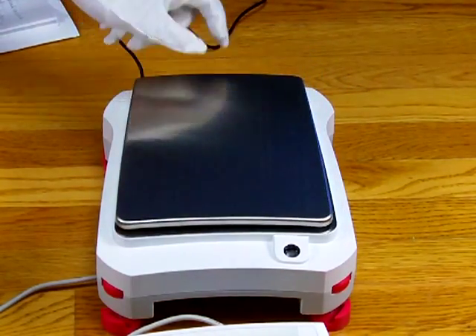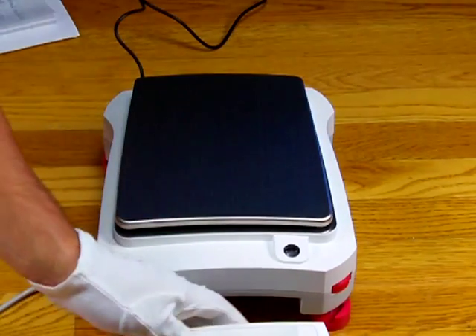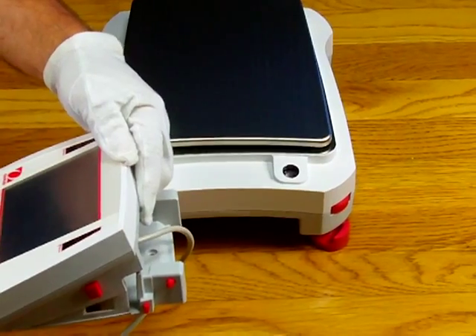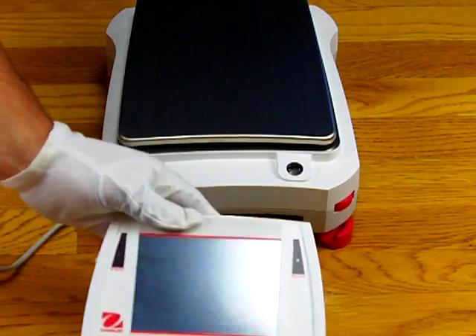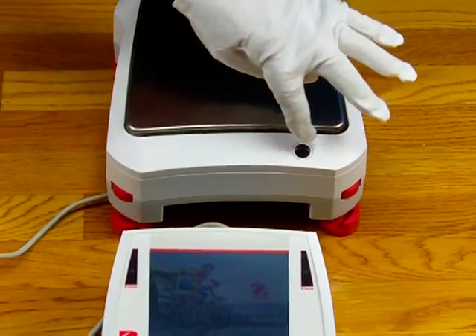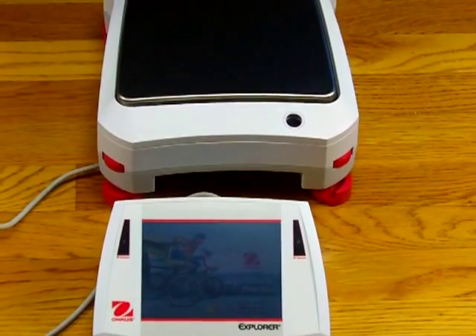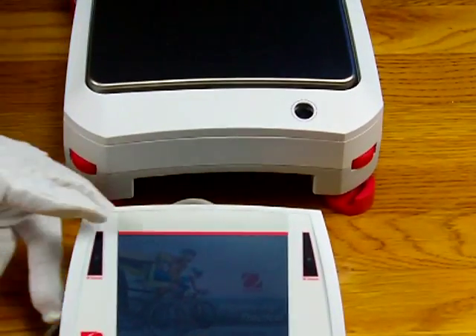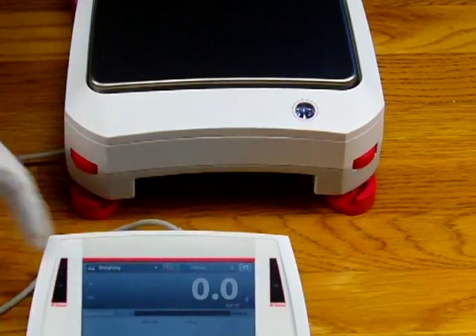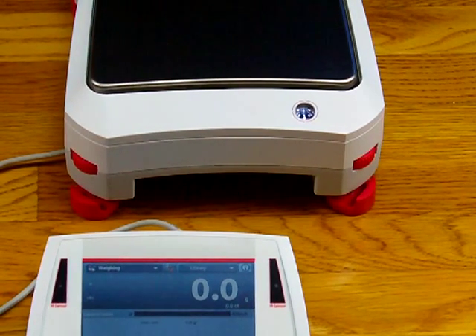Some other features on the balance: we have a spirit bubble level indicator. When you power up this balance, I'm going to put it into standby mode first — entering standby mode, pressing yes. Now the balance is in standby mode. When this balance powers up, this spirit bubble indicator will flash and light up, giving you an idea if the balance is level or not. Pressing the button to start the balance out of standby mode — it's telling the operator to level the balance. The menu has an intuitive guide to help the operator in leveling the balance.